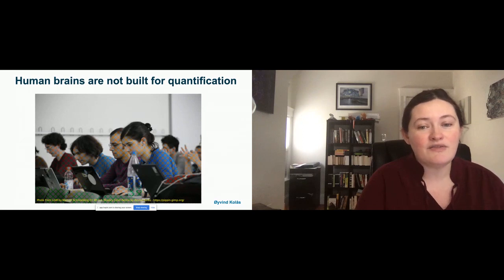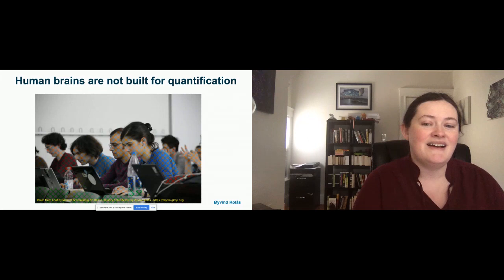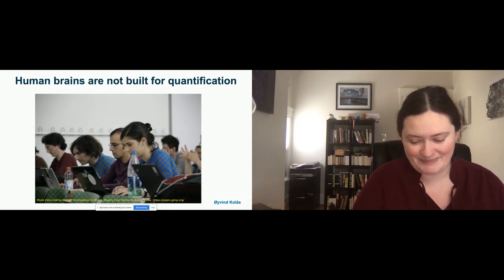So even if you have a phenotype where you think that you can see it very well, and you don't have enough heterogeneity that you're interested in it, you don't think you have enough images that it's worth building an image analysis pipeline, I would try to convince you that it is, because your brain lies to you a lot.